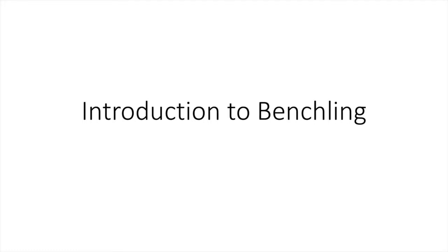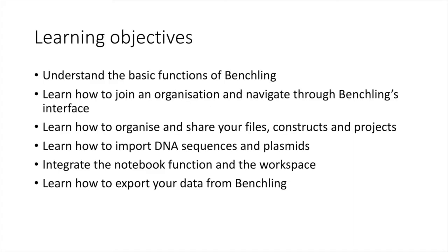This is the first installment in a video series about the online scientific software Benchling. In this video, we will understand the basic functions of Benchling, learn how to join an organization and navigate through Benchling's interface, learn how to organize and share your files, constructs, and projects, learn how to import DNA sequences and plasmids, and integrate the notebook function and the workspace, and learn how to export your data from Benchling.